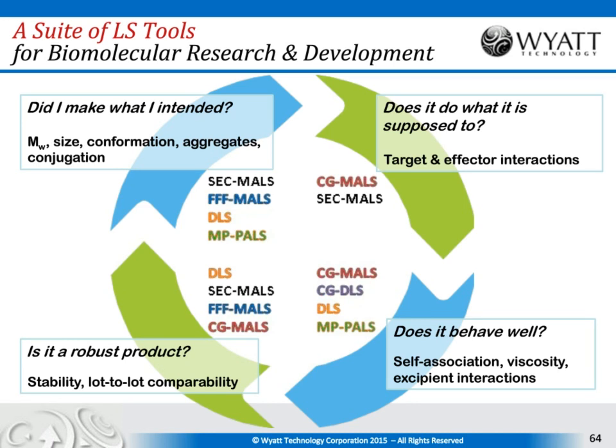Because you have the option of putting in many replicates, you can also assess your precision and your error across the different replicates. And you can basically go up and down in temperature, and you can see whether you recover the original situation. Now, if you're looking for a very precise measurement of size, say of a nanoparticle, the precision on that is something like 15 to 20%.